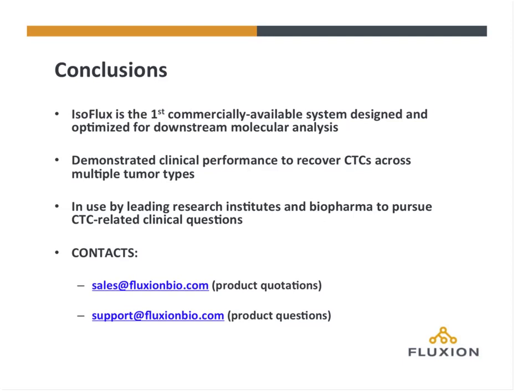You can simply preload the collection tube with the plasma, and then that'll be automatically collected when you recover the collection tube. Or if you're using the low volume recovery holder, you can load your pipette with the patient's blood plasma, 10 to 20 or more microliters of that. And then as you aspirate the cells off of that recovery holder, you'll be suspending the cells in the plasma, and that can be transferred to a downstream collection tube.